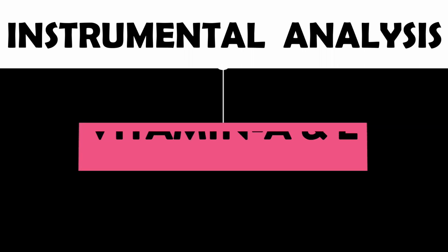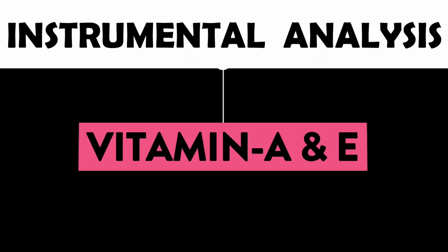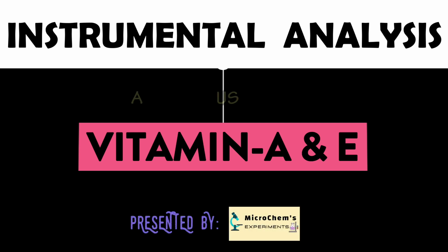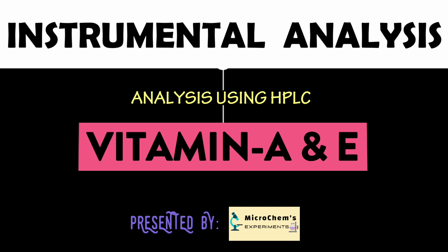Hello viewers, this video is the second part of Vitamin A and E analysis, which represents the details about the instrumental analysis using HPLC. Welcome to Microchem's experiments.